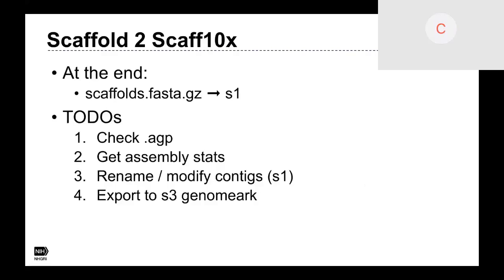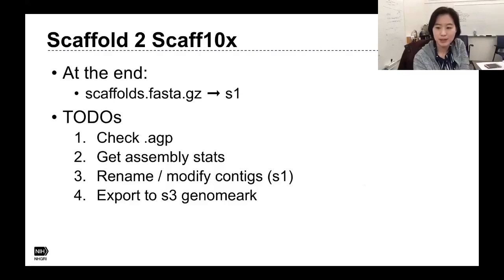So I already communicated with Oliver that going forward we would like all the inputs to be renamed according to the standard, because later on when you run Long Ranger, it's going to require that pattern anyway, otherwise the app is going to crash. But meanwhile, for the next month or two, data that you got from Oliver long ago might not have this name combination. So make sure that you check first. If you see any differences between what you expect and what is there, please report back, because that was our file naming convention. It should follow all the files on GenomeArk, especially the genomic data, which has a specific file name convention. If you see any malformed files, please report back so we can fix those as well.